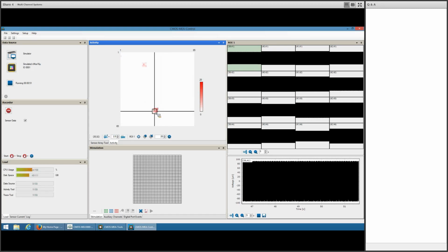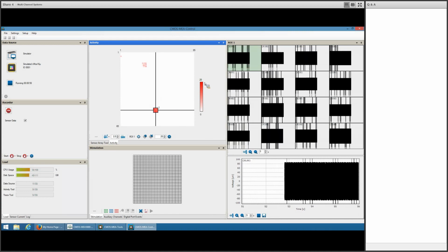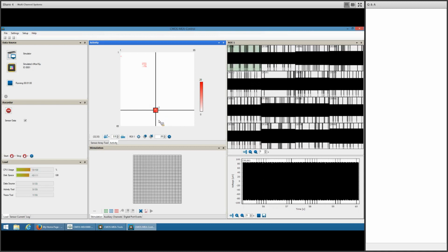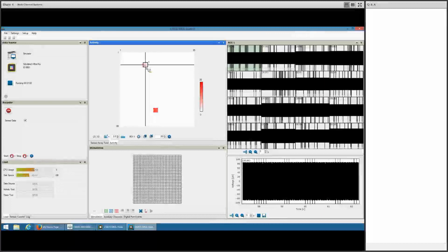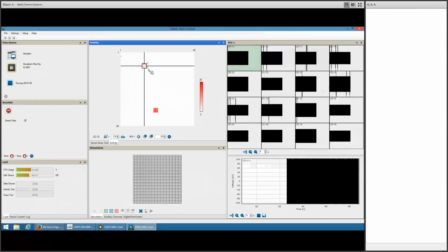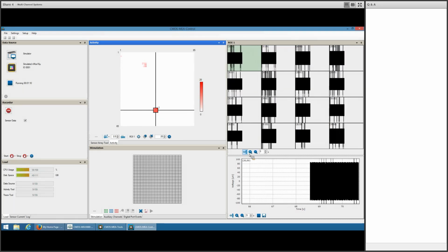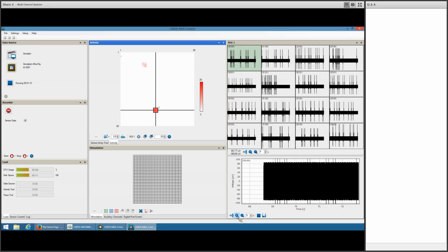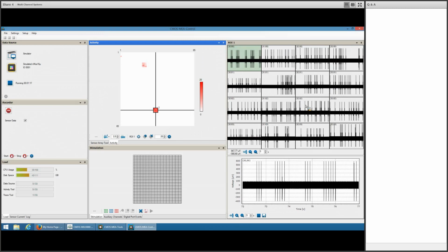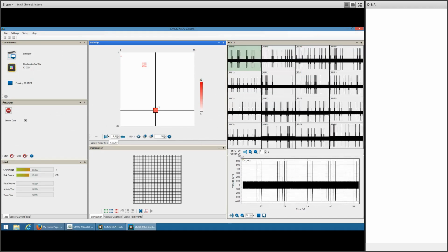So these are artificial signals now, of course, but this will give you color-coded, within 200 millisecond bins, the spike count. And you immediately see activity spots within your culture, and then you can move that region of interest to that specific spot and see the corresponding raw data over here. This is the channels within that region of interest, and that is one channel zoomed in.